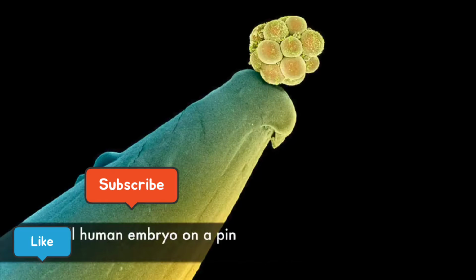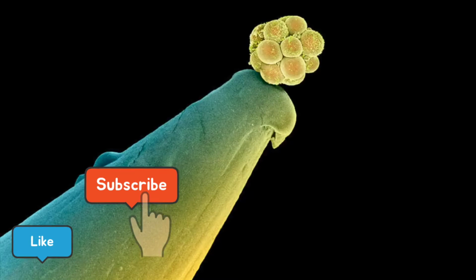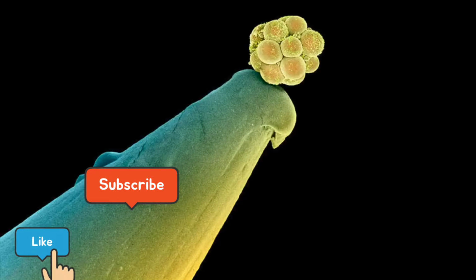A human embryo at the 16 cell stage on the tip of a pin. The yellow ball of cells of the embryo is known as a morula, a cluster of almost identical rounded cells, each containing a central nucleus. This 16-cell embryo is about 3 days old. It is at the early stage of transformation from a single cell to a human composed of millions of cells.